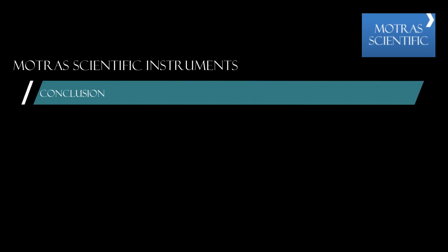Thus, to conclude this video, we have seen the test store functionality and downloaded the Nitrate test from the internet. We have also seen the reslope function. The tests are saved on our secured server and are updated from time to time.